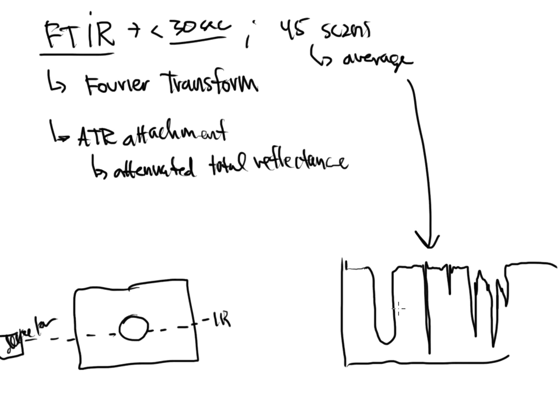Well, what's this ATR attachment? Well, the ATR attachment is this box that sits on top of the infrared, and on this box will be a platform that will hold a diamond, a real synthetic diamond. Now, how can that be, a real synthetic? That doesn't make sense. Okay, a synthetic diamond.